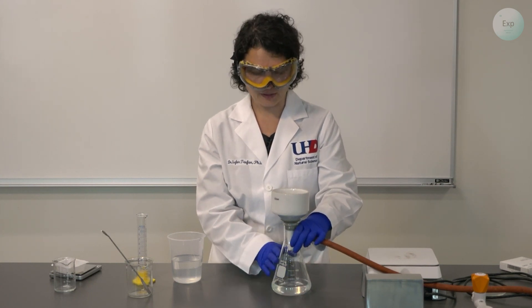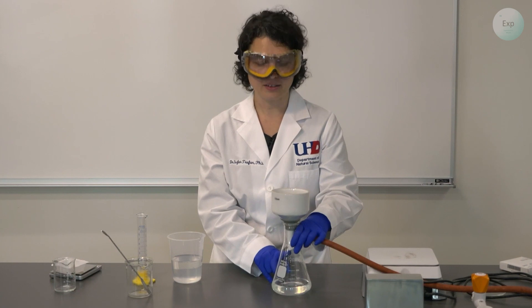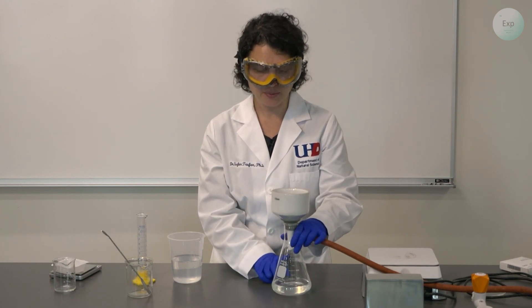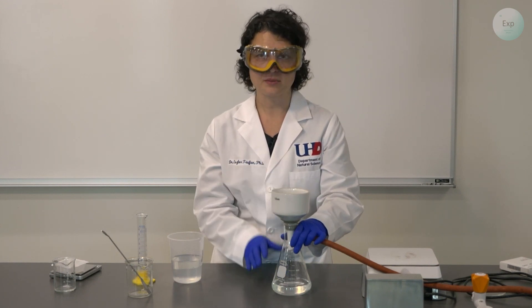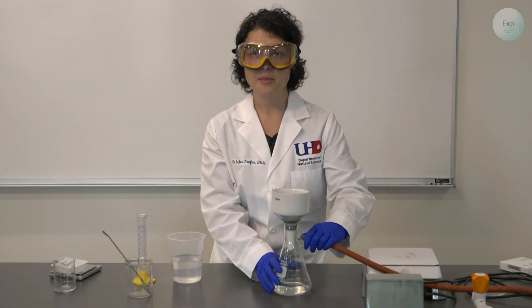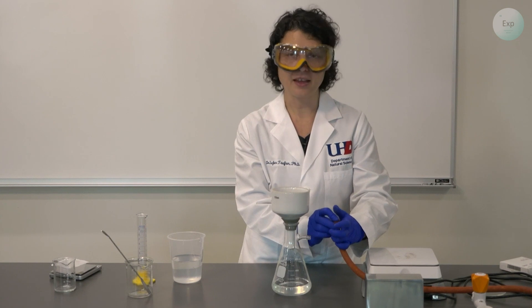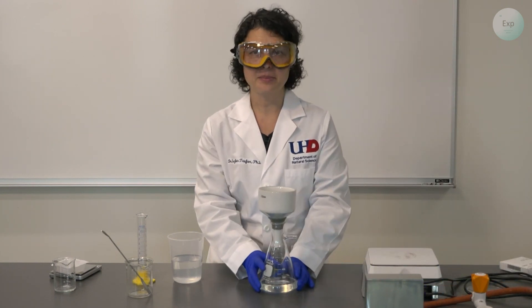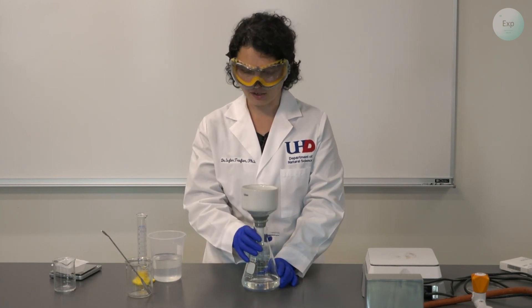Usually a good sign for the filtration being complete is when the drops of water stop dripping — that may take a little bit longer. What we are looking for is the calcium carbonate layer on the filter paper to start cracking and show signs of dehydration. My filtration is now complete. I will disconnect and turn off my vacuum, and prepare to extract the filter paper and dry it on a hot plate.